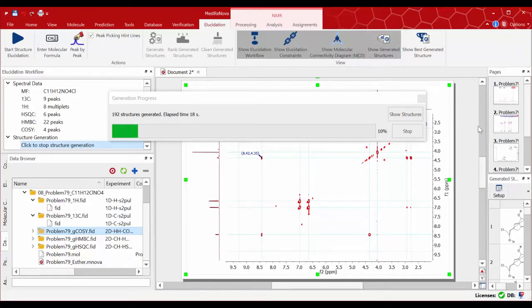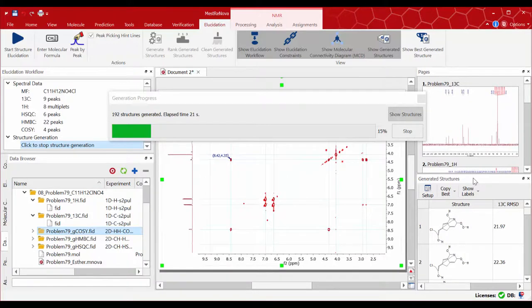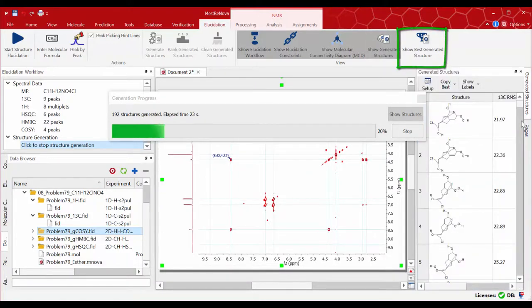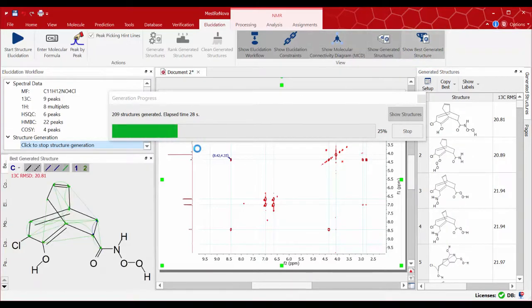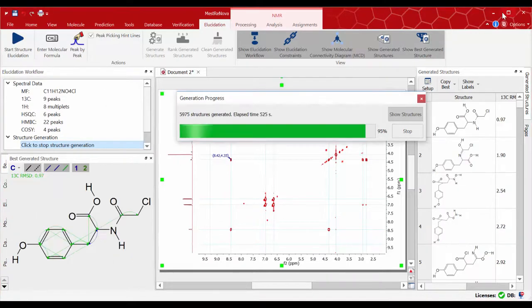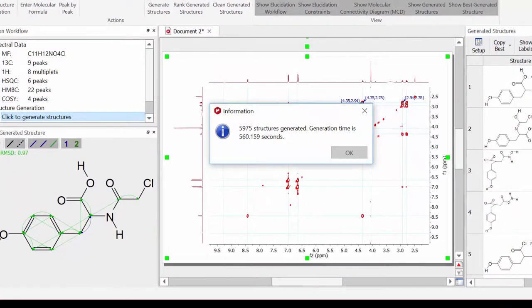You can fit the generated structures table anywhere you want around your screen. While the elucidation is in progress, you can also show the best generated structure. You'll see arrows appearing in the molecular connectivity diagram corresponding to the added correlations. This process will take a few minutes, so this part has been speeded up. A panel with the number of structures generated and time spent on the analysis will be shown when the process is completed.